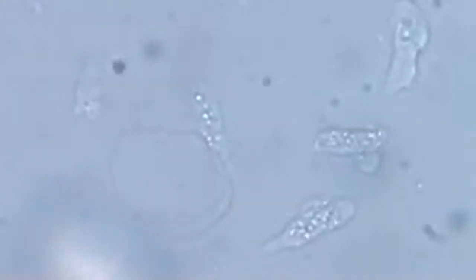Beautiful. Those little cell inclusions move with the body movement. No distinct figure, no distinct shape, no distinct organelles specially located. Everything is everywhere.